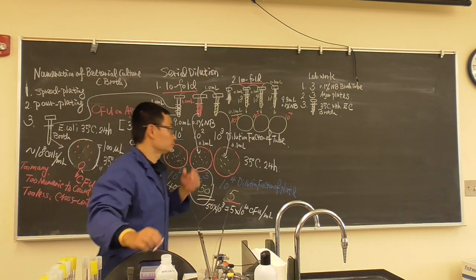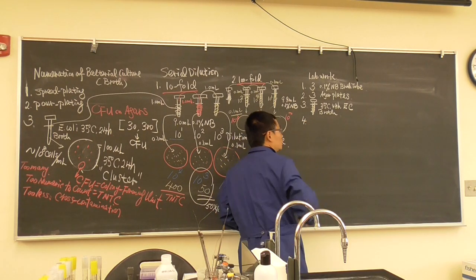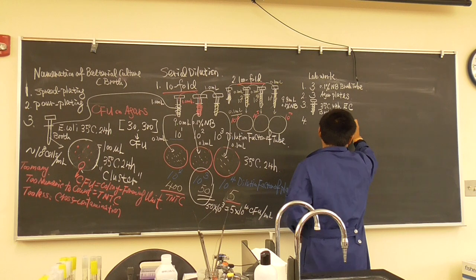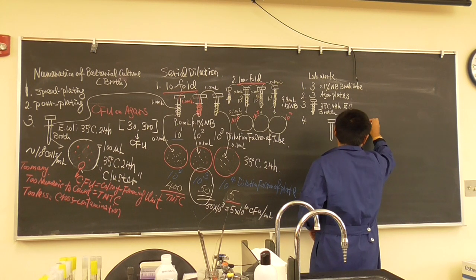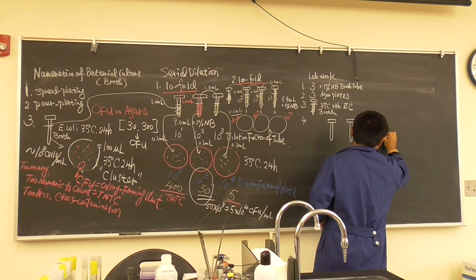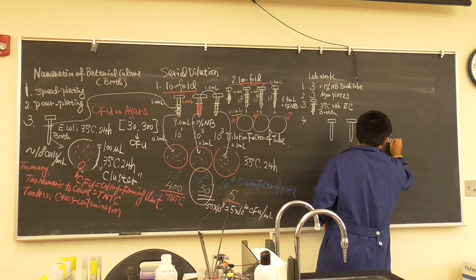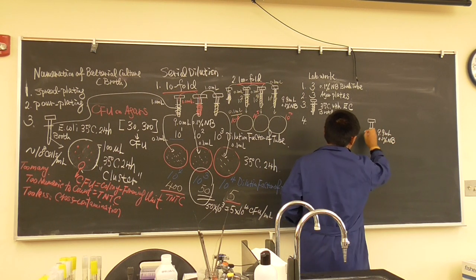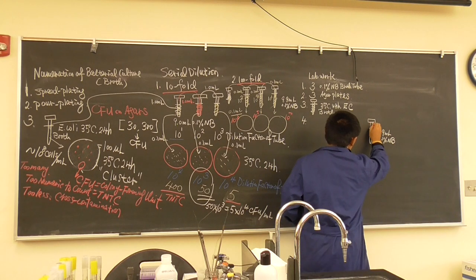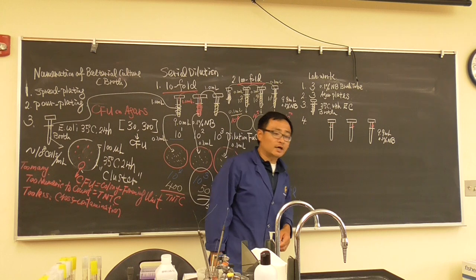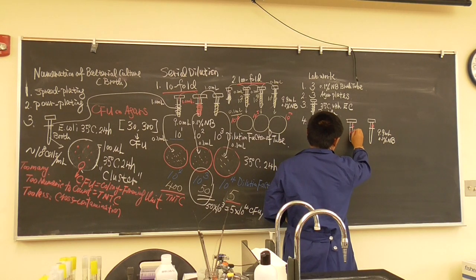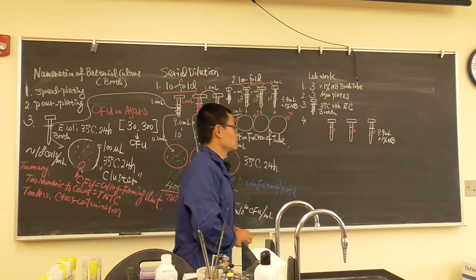First thing: do the serial dilution. You have three tubes, each already containing 9.9 ml of 0.1% nutrient broth. Label them 1, 2, 3 and write the dilution factor on each tube: the first one is 10 to the 2, the second is 10 to the 4, and the third is 10 to the 6. This is the first step.